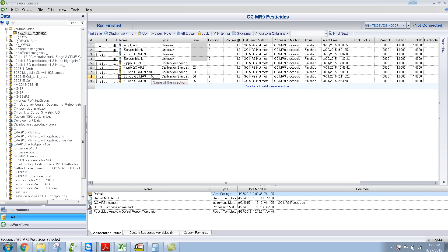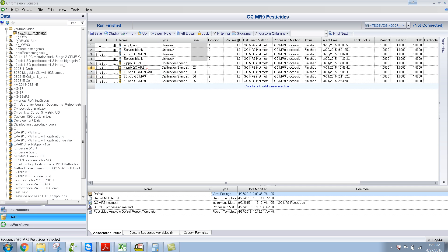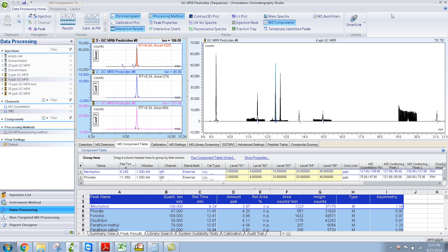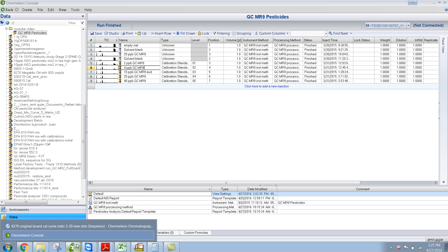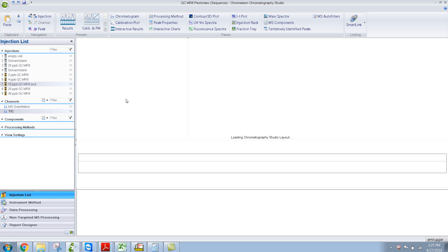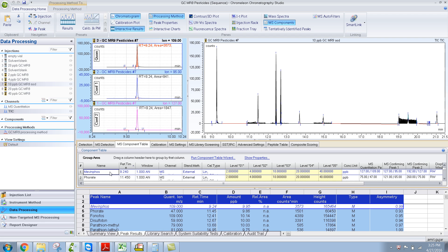F2 is applicable anywhere you need to type in. When I started using Chromelion, I would always click pretty fast and it used to open the studio, and I'd get confused because I just wanted to type in a name. If you click slowly you can type in directly, but F2 works pretty well. For example, in the studio, if I want to change the name of a sample, I just press F2 and I can see the cursor and make any changes I want.